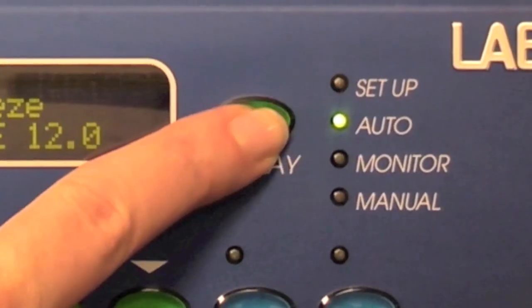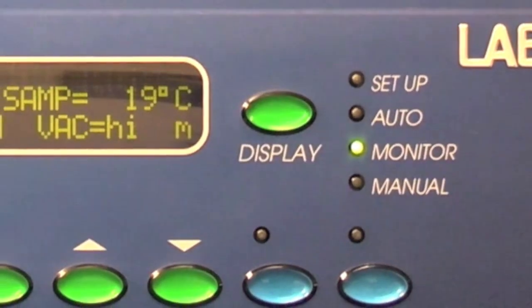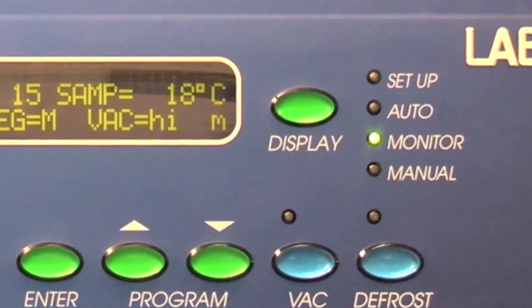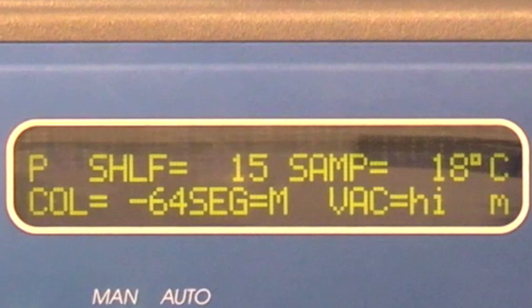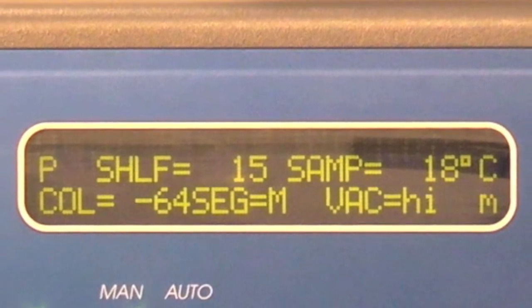To monitor the system during operation, press the display button to obtain the monitor screen. The display will show the collector temperature, shelf temperature, system vacuum, and sample temperatures.